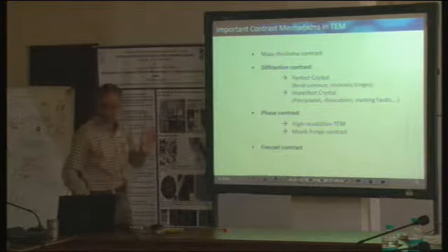Okay, so I think we have finished with mass thickness contrast. So that is done. Now we talk of diffraction contrast, which we have already introduced also. We have seen one example, but we will try to look at it in more detail. For example, the real image. Why is it that electron microscopy images are able to be so sensitive to these grains?